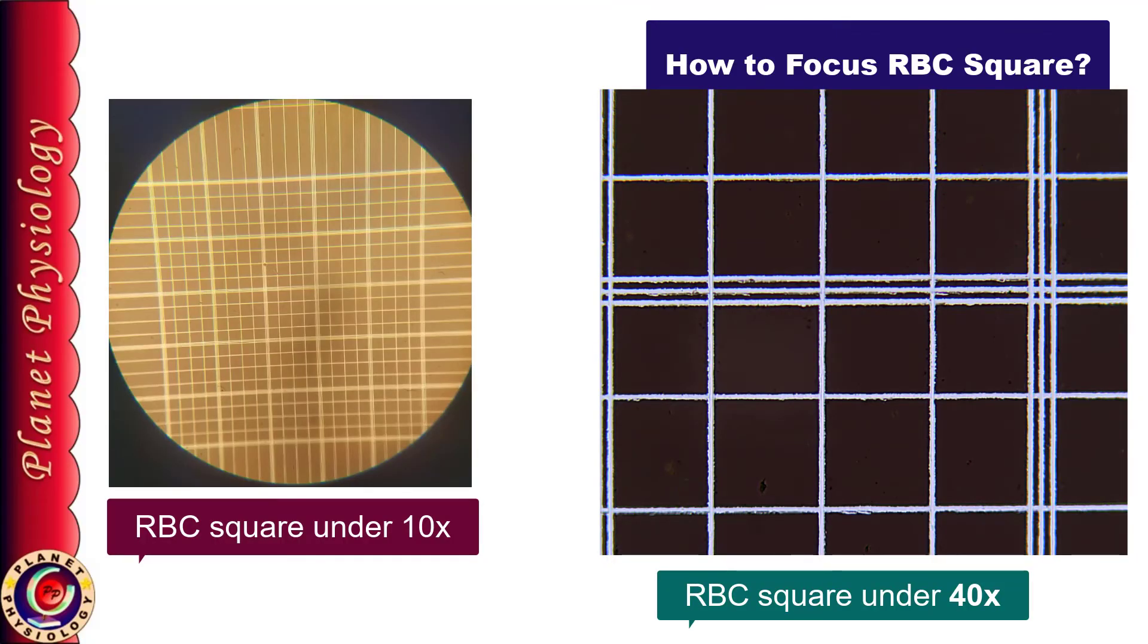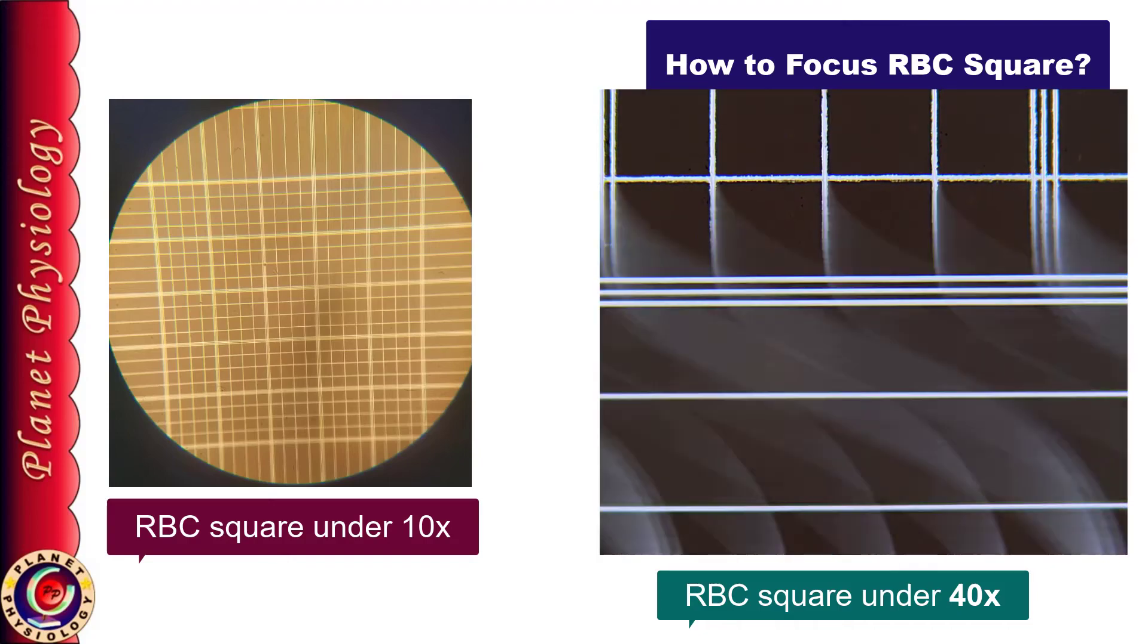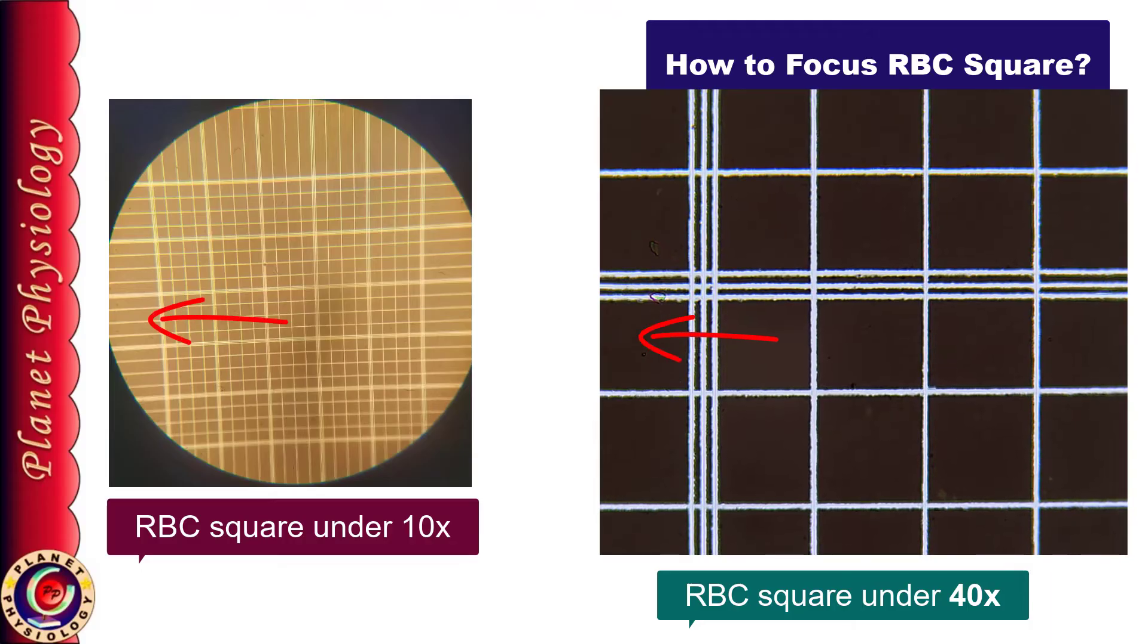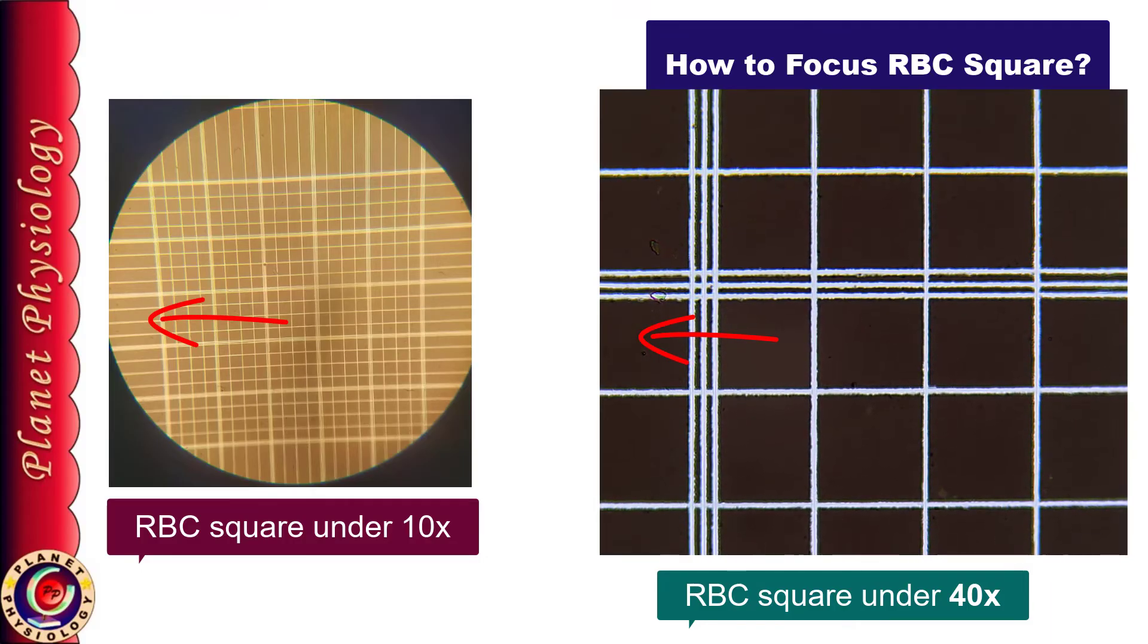So I don't know in which part I am. So I am moving it sideways. I am moving towards left side. Here I can see only horizontal lines on one side of triple lines and there are squares on the other side. That means I have reached to the boundary of the RBC square.